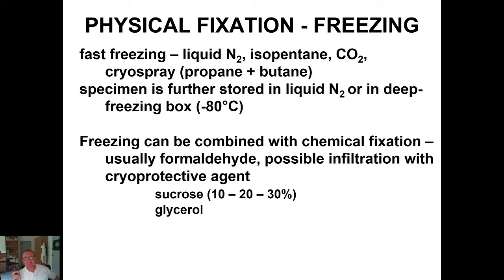Freezing can sometimes be combined with chemical fixation, and in this case we are using cryoprotective agents. Cryoprotective agents can be added to the chemical fixation, or are used after the chemical fixation, to protect the tissue against formation of ice crystals.